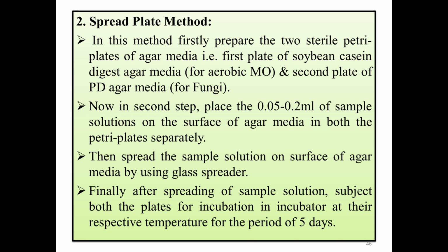For a period of 5 days at a respective atmosphere, according to the test, or whatever temperature we want. According to that temperature we'll incubate that sample for 5 days in the incubator. The incubator is used to cultivate the samples, or what we can say, to grow the microorganisms.